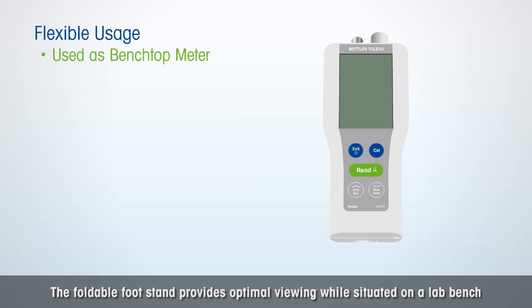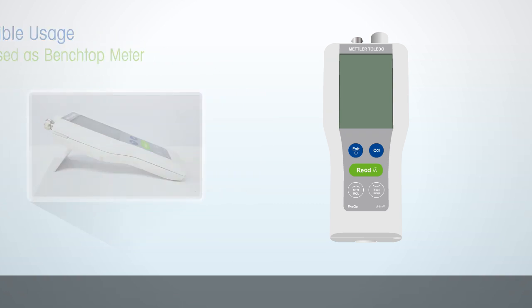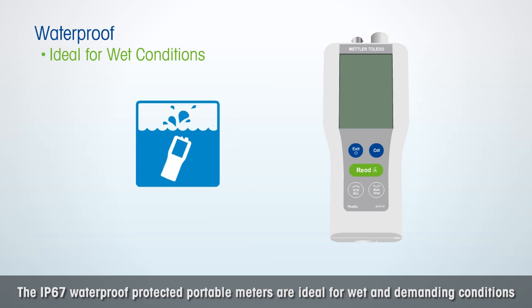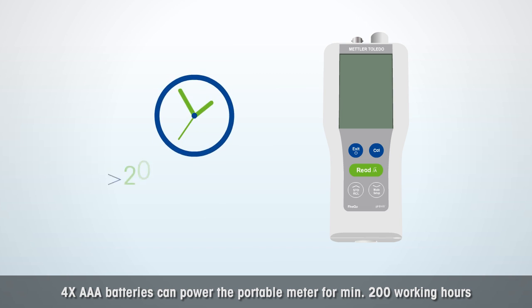The foldable footstand provides optimal viewing while situated on a lab bench. The IP67 waterproof protected portable meters are ideal for wet and demanding conditions. Up to 200 measurement data can be stored. 4X AAA batteries can power the portable meter for a minimum of 200 working hours.